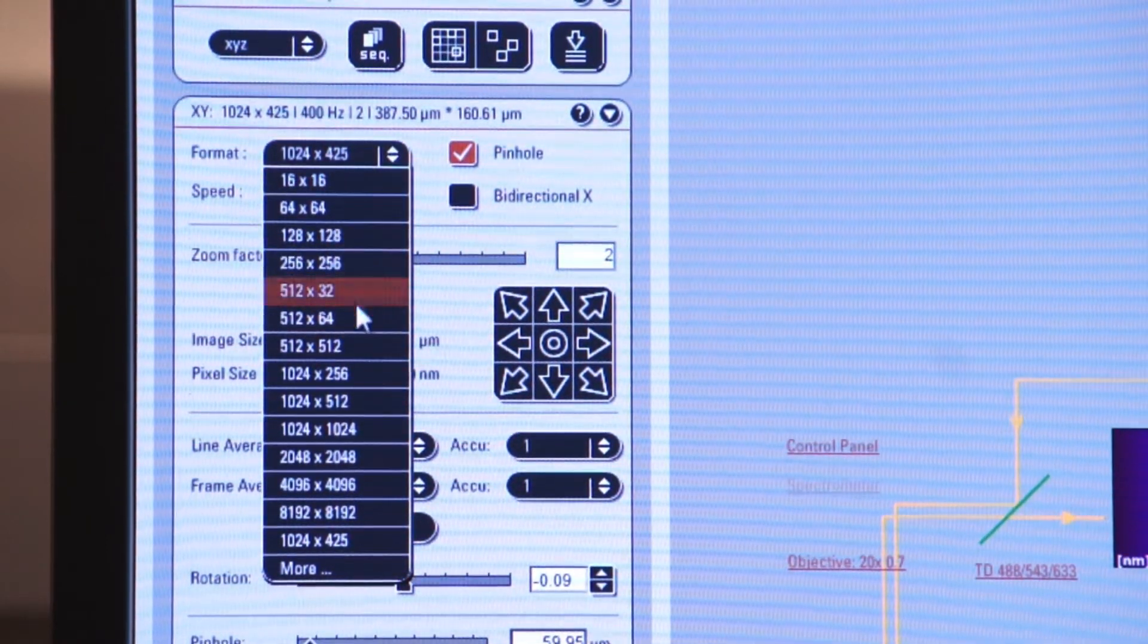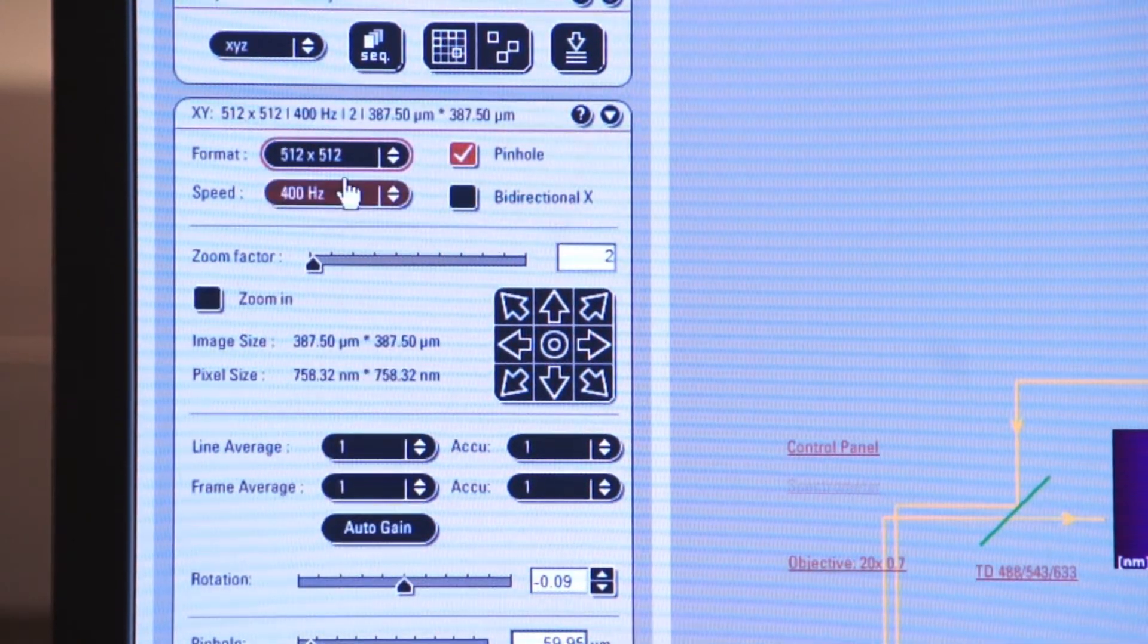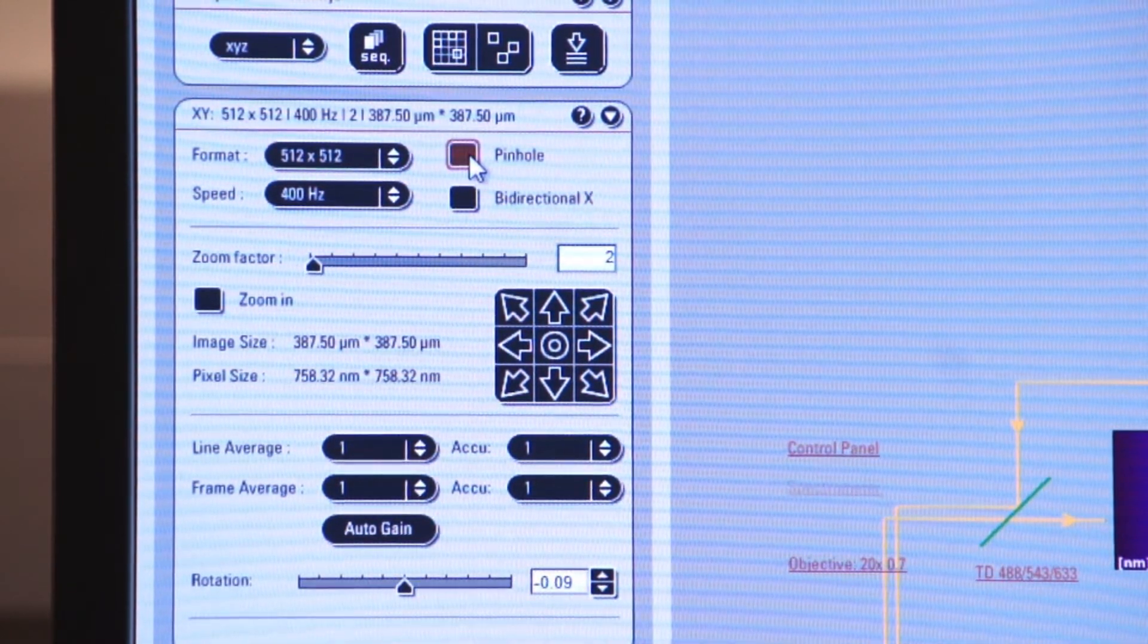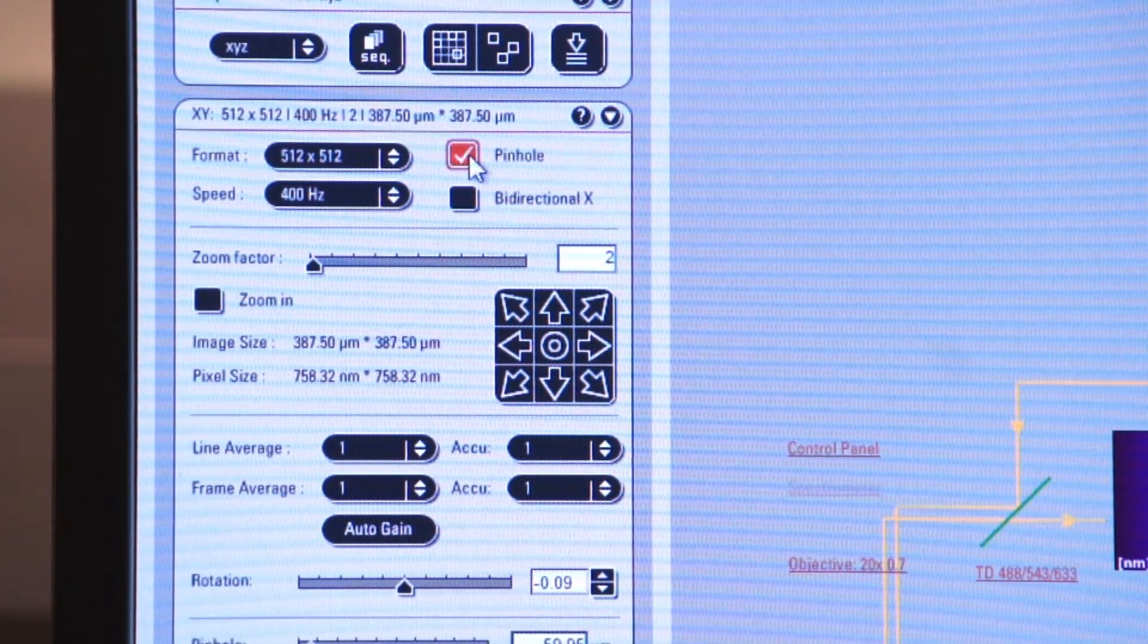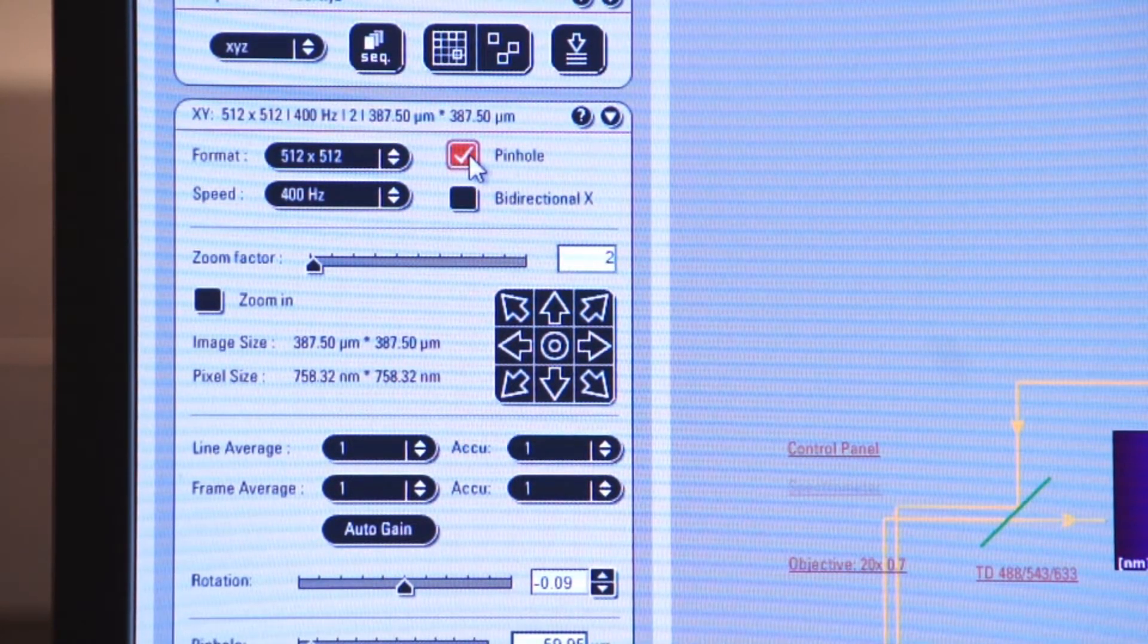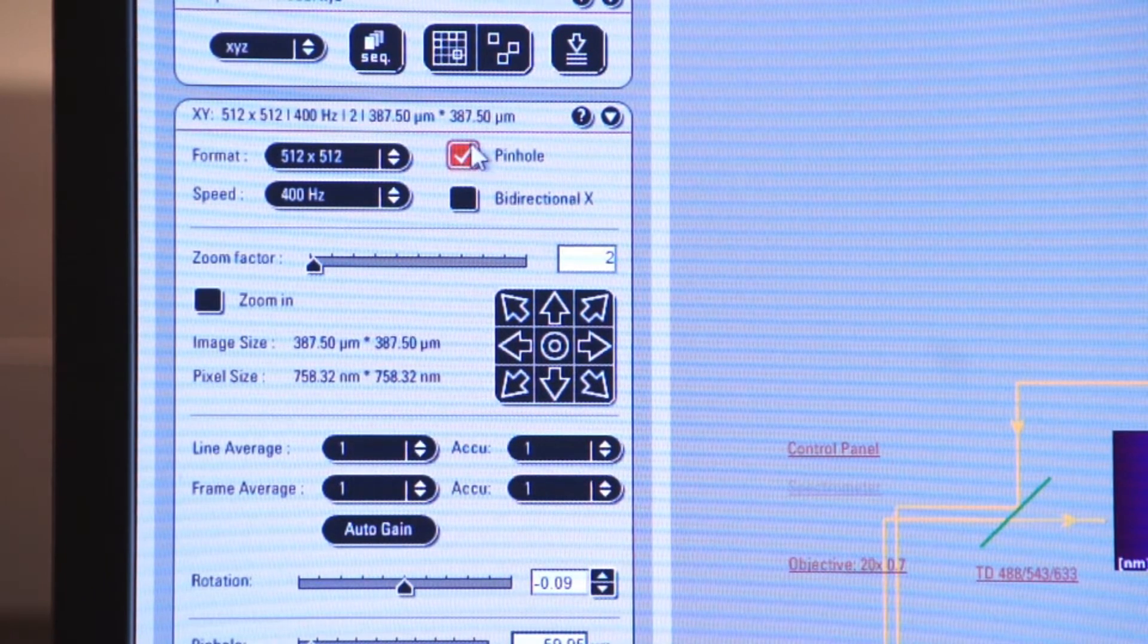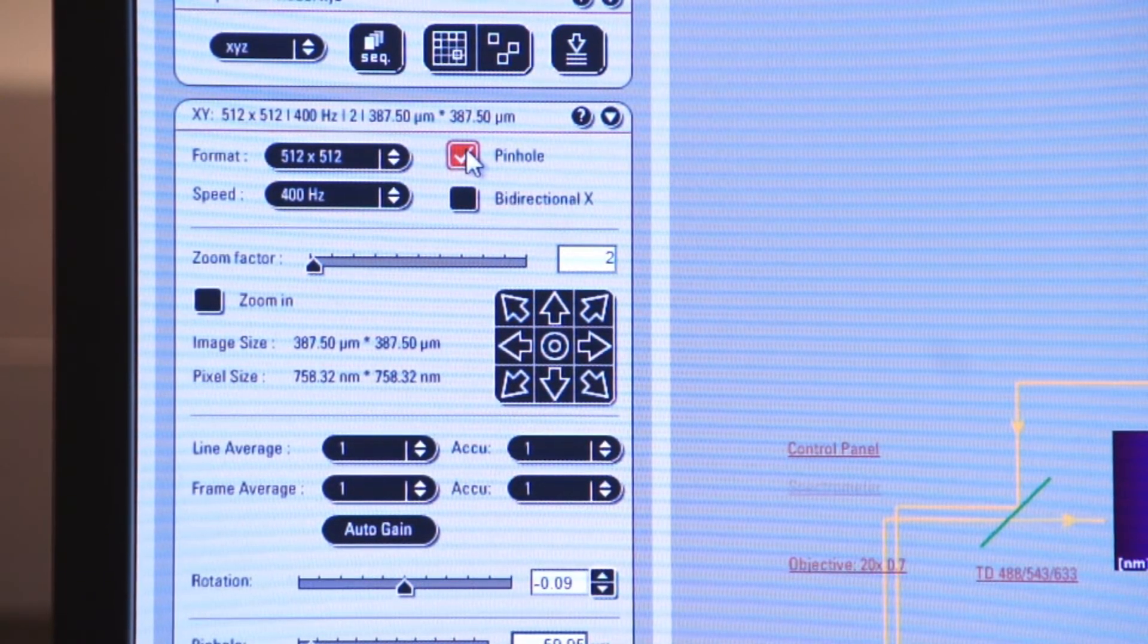For now, let's leave it on 512 by 512. We also have a pinhole feature that allows us to change the size of the pinhole, and I'm going to show you how that affects your image in a second.